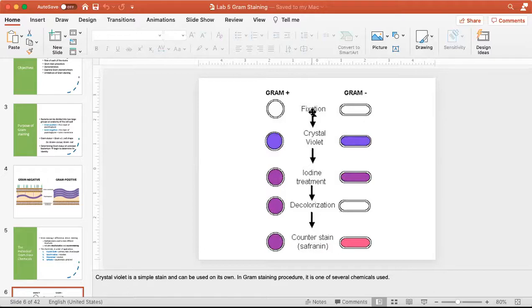They're telling us that 2 smears were made, and they were both heat fixed, and now we're ready for Gram staining. Remember, the first stain is crystal violet. Crystal violet gets applied to these cells for a certain amount of time, and we'll talk about that. And it stains the cells this purpley blue color.